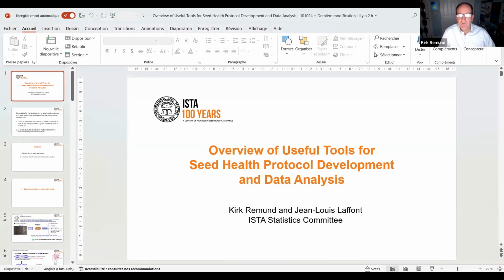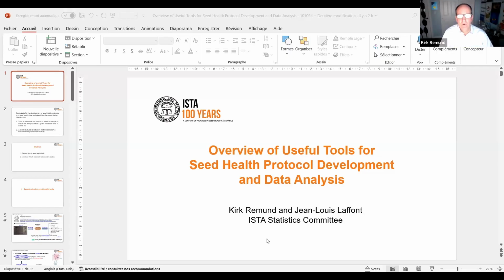So we will give you, I think, a taste of some of the tools that are available for seed health testing. Just a taste, a primer today, and we will look for opportunity maybe in other forums to go in more detail and share them at length and some of the other options. But indeed, we will show two tools, Seed Calc and an implementation of the Langston's method.